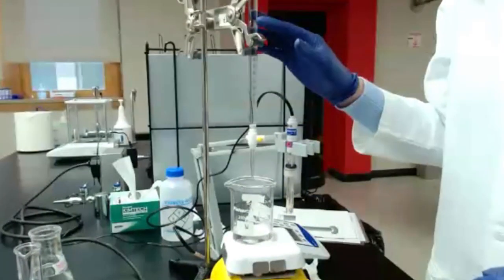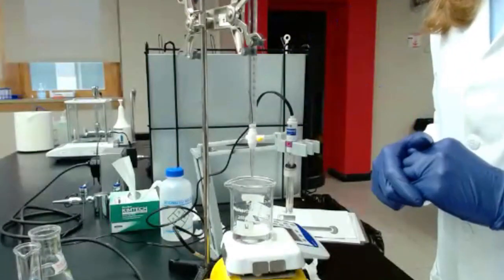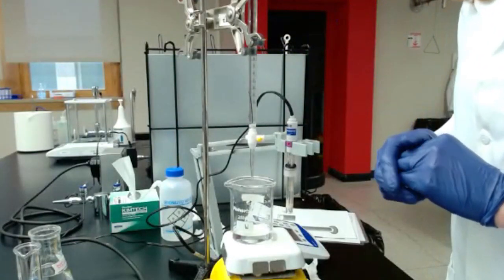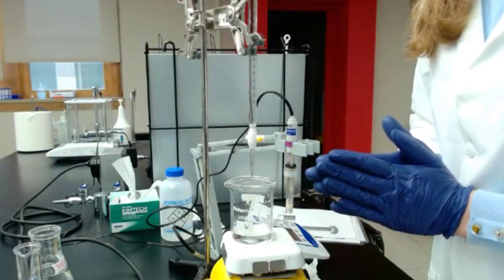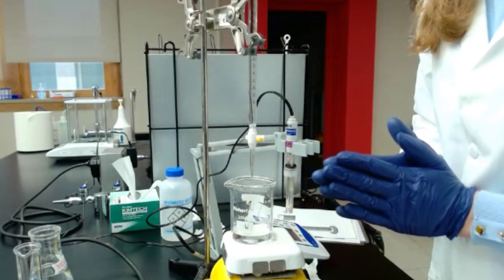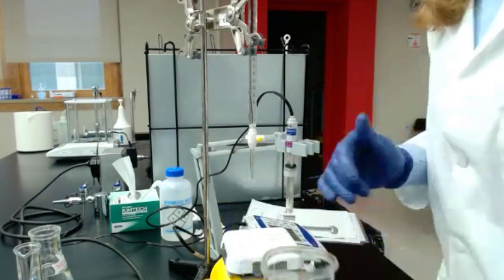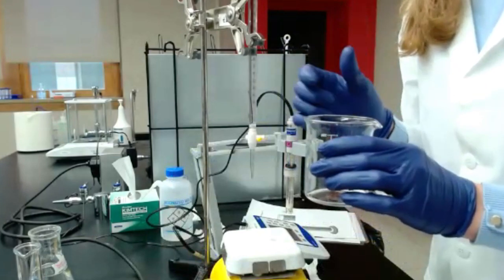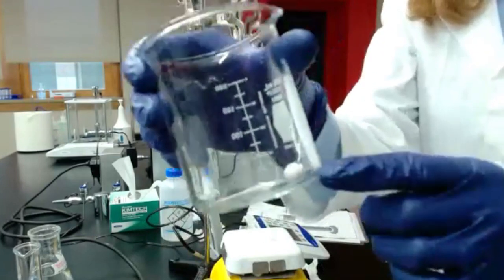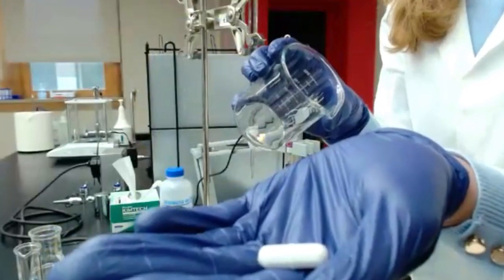So we have our solution of sodium hydroxide. The first step we're going to do is to make sure the water we're going to use is at a correct pH, so it's going to be standardized as well. In the beaker you're going to use to do the titration, you will need to have a stir bar if you have a stir plate.